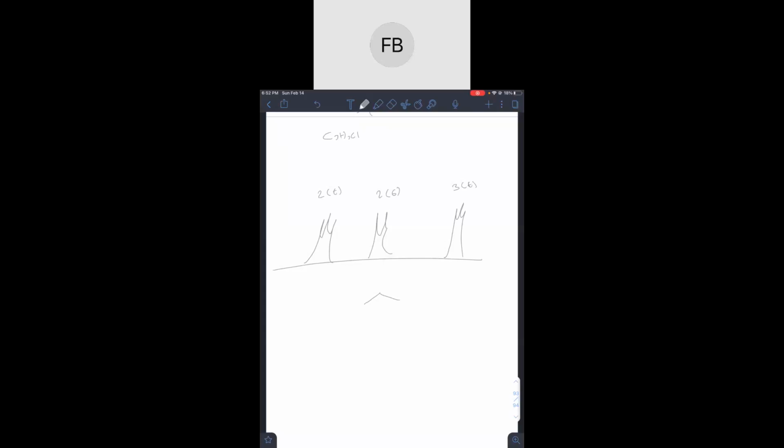Based on that, you can tell that from the middle, one of the ones on the end is just going to be a methyl. It's just going to have 3 hydrogens, because it doesn't add up correctly otherwise. With the other 2, at this point you can already tell what's happening on the next one. You know that there's 2 here. And then by process of elimination, there have to be 2 on the one on the end.